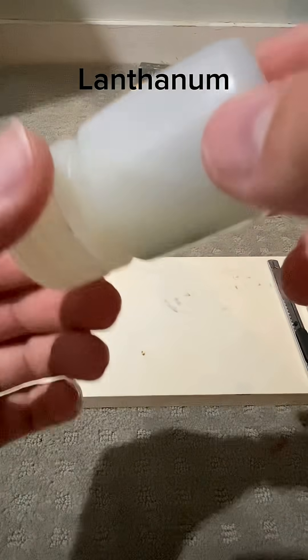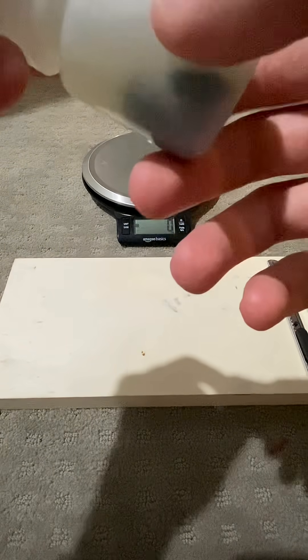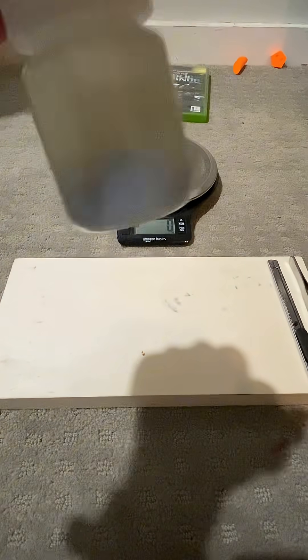Here I have some lanthanum metal. Lanthanum reacts with air to make lanthanum oxide, and it just degrades in air — and even in oil it degrades.